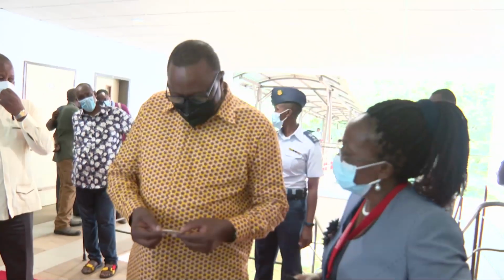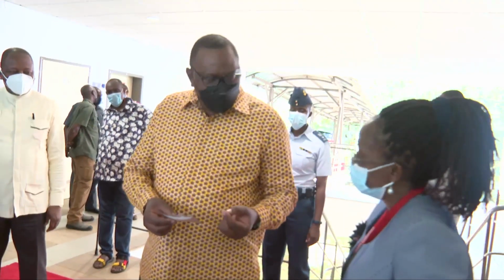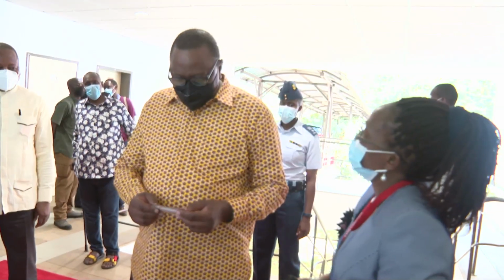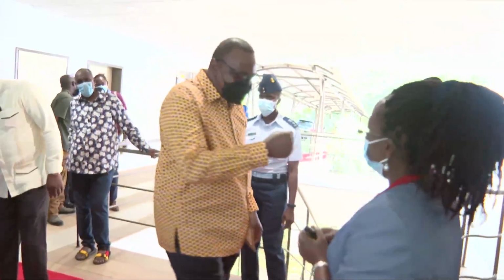Yeah, we're just in the process of finalizing it. So come December we will. And what will it do with the drop of blood? Yes, it is just a rapid test. Finger-prick. Yes. Thank you, ma'am. Thank you.